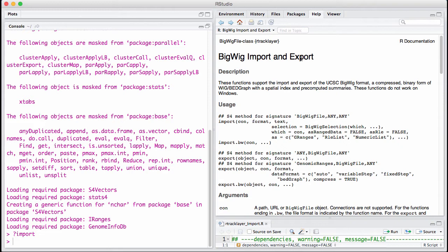BED files are very easy to read in, they're usually small files, and they're very similar to GRanges. We're going to do an example of reading in a BigWig file. A wiggle file is a file that just contains some kind of signal along the genome, some kind of numeric quantity.